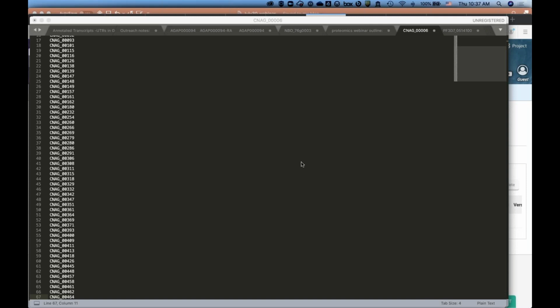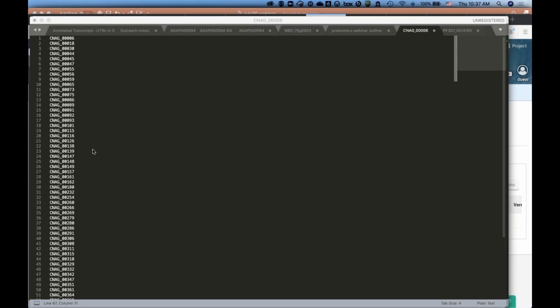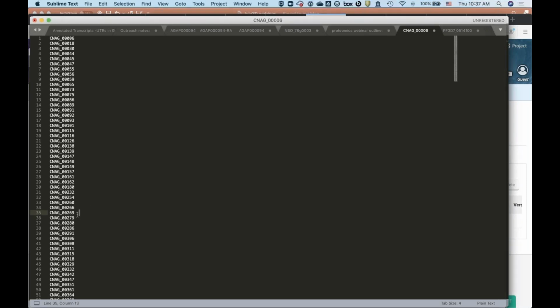But you could imagine a scenario where you have a list of genes that came from a mass spec experiment you did in the lab. You did all your analysis, and you have whatever 100 genes, and here I've taken a list of 67 random genes from Cryptococcus in this case. I want to put them into FungiDB in this case. These are fungal genes, because I want to ask additional questions about these genes.